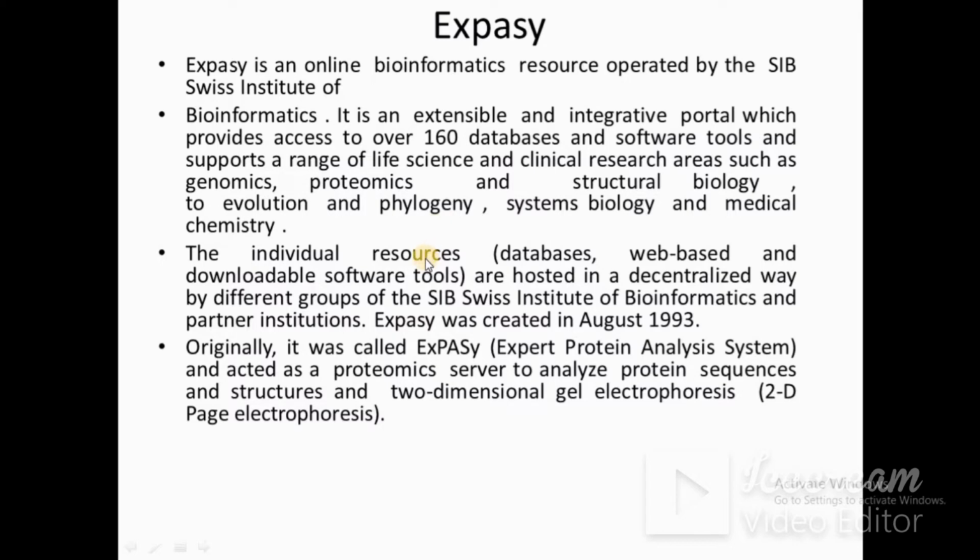The individual resources, that is databases, web-based and downloadable software tools, are hosted in a decentralized way by different groups of the SIB and partner institutes.